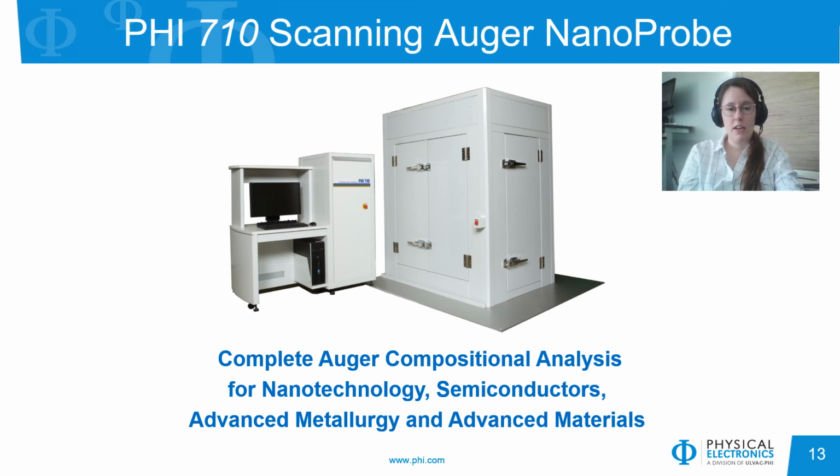In conclusion, I hope I've shown you today that we can use the multi-technique scanning Auger nanoprobe as a complete compositional analysis for many applications, including nanotechnology, semiconductors, advanced metallurgy, advanced materials, and many other types of applications.